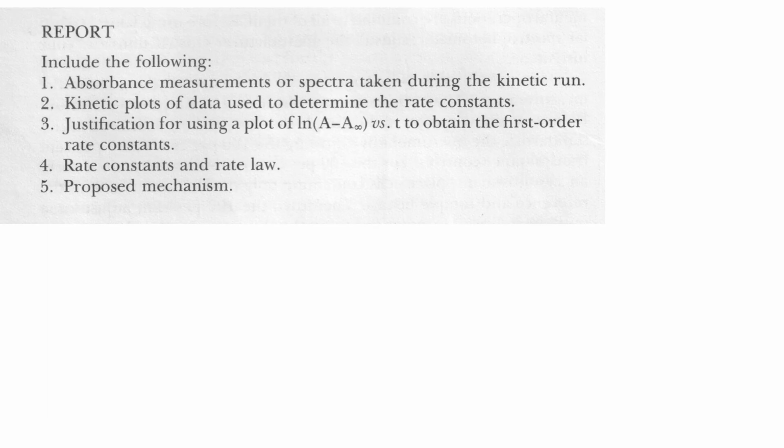Now your report should include the absorbance measurements every 15 minutes for the 0.1 molar solution and the 0.3 molar solution. Secondly, you have to have the plot of ln (A minus A infinity) versus time for 0.1 molar and 0.3 molar, and you calculate K at each concentration, and the justification why we plot ln (A minus A infinity) versus time. Before you come in the lab, you should answer the questions.